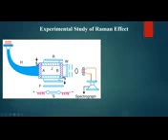Then incident radiation is taken from a mercury arc or mercury source. Source S is represented here. This will produce a number of spectral lines. Then a particular filter is used, which is transparent to only a particular wavelength, which produces monochromatic light. That means if a red filter is used, only red light passes through it. When a blue filter is used, only blue light can pass through. So monochromatic light is made incident on the liquid.